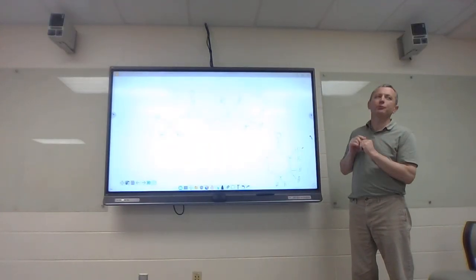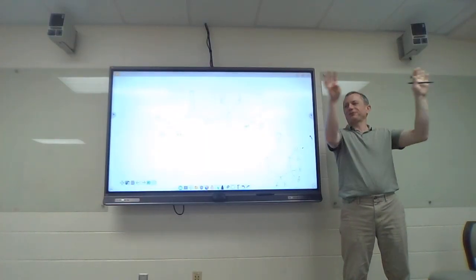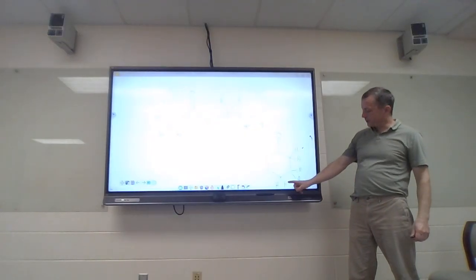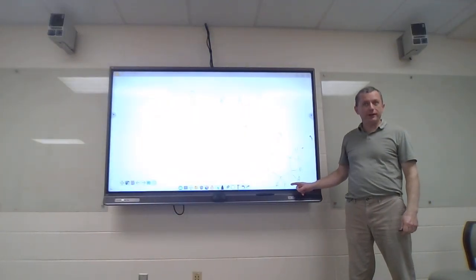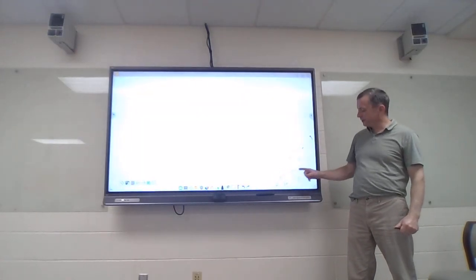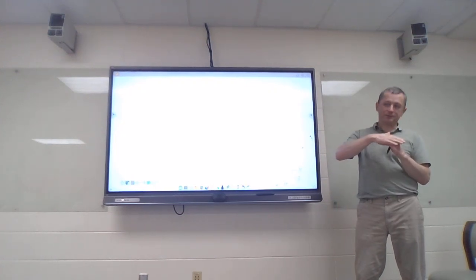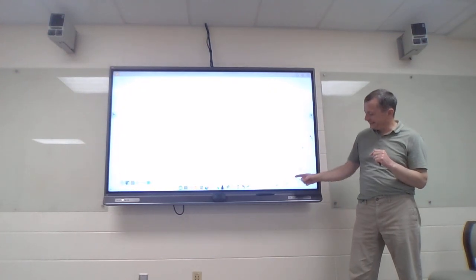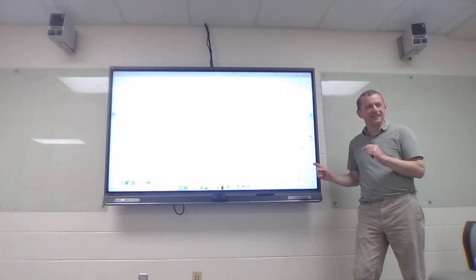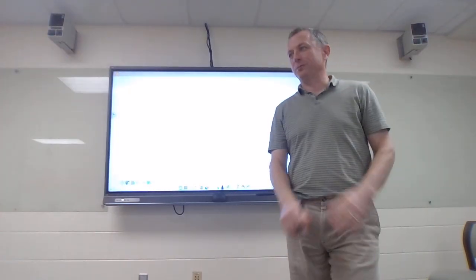I argue it's making it even worse than a triplet of triplets. How do you take 3 peaks and make it 3 peaks on top of 3 peaks on top of 3 peaks? It's even worse than that. It's probably these two are never identical. And so this one causes different splitting than that one. And that's because one's equatorial, one's axial. So you're really getting a doublet of a doublet of a triplet. And it doesn't move that much. It's all on top of each other. That's where I would call that a multiplet.